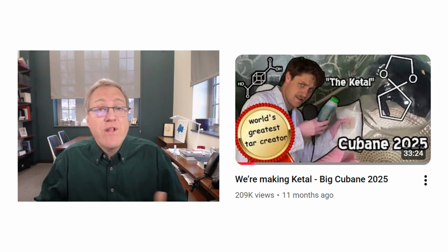This is a reaction video. I'm reacting to a video put up by Extractions&Ire. Now the particular video I'm reacting to is actually two separate reactions. On the first end, he makes cyclopentanone. And I've already done a reaction to a previous cyclopentanone video from Extractions&Ire. So I'm actually looking at the second half of the video, which is making a ketal from cyclopentanone. So we're just looking at the second half of the video.